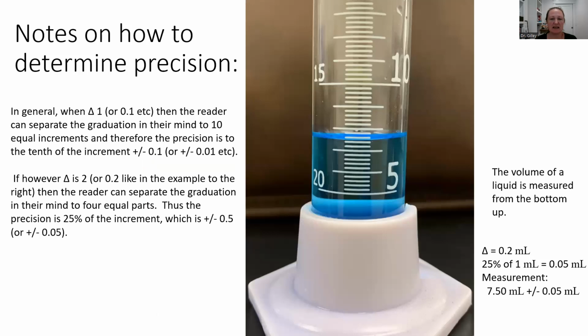Okay, so here's an example, and you guys are not going to run into this because KLM has provided you with graduated cylinders, and the delta value is always going to be 1 or 0.1. So you will always be measuring plus or minus 0.1, which would be milliliters because we're measuring volume in this case, or 0.01 milliliters.